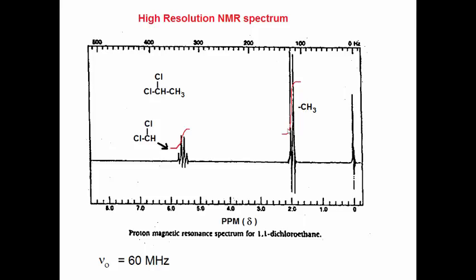What we're seeing here is a general phenomenon called spin-spin splitting or spin-spin coupling. In a nutshell, each set of signal protons is split into a multiplet of peaks, and this splitting is caused by the magnetic influence of the protons that are neighbors to the signal protons in the molecule. Let me explain.